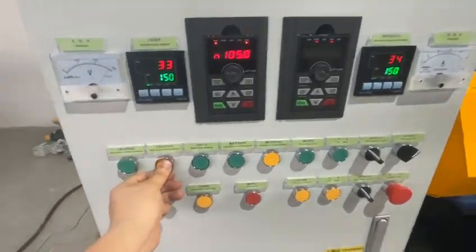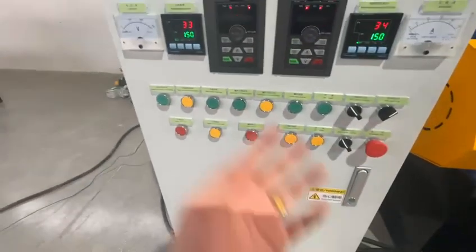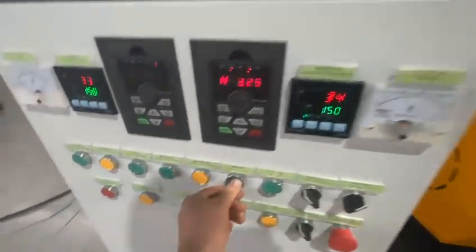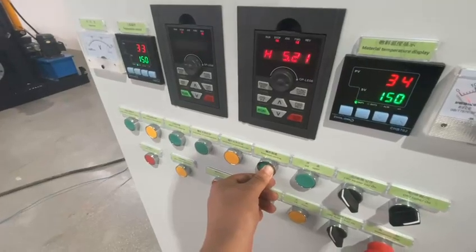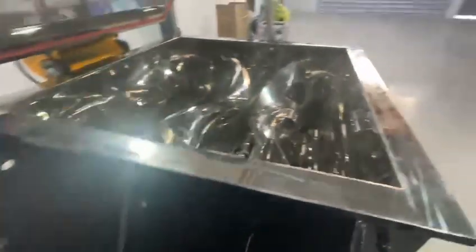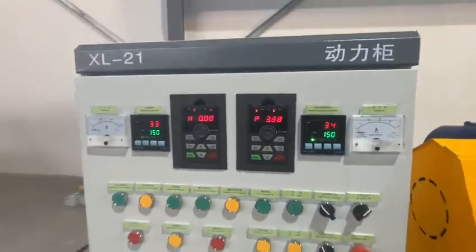Let's also test the discharging screw with the inching switch — some speed, and then I keep my hand on the button. The screws are also working. Once I remove my hand, it stops.